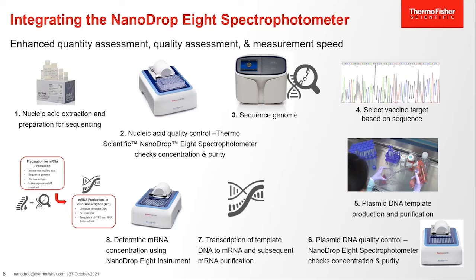So now that we have an idea of how the whole mRNA vaccine process works and how UV-Vis technology and the NanoDrop Eight fit in here, we can take a deeper look at the NanoDrop Eight and why it's a useful tool in this whole workflow.